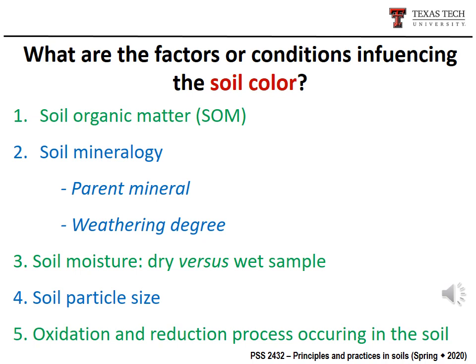And the second factor that influences soil color is the soil minerals, the clay minerals.